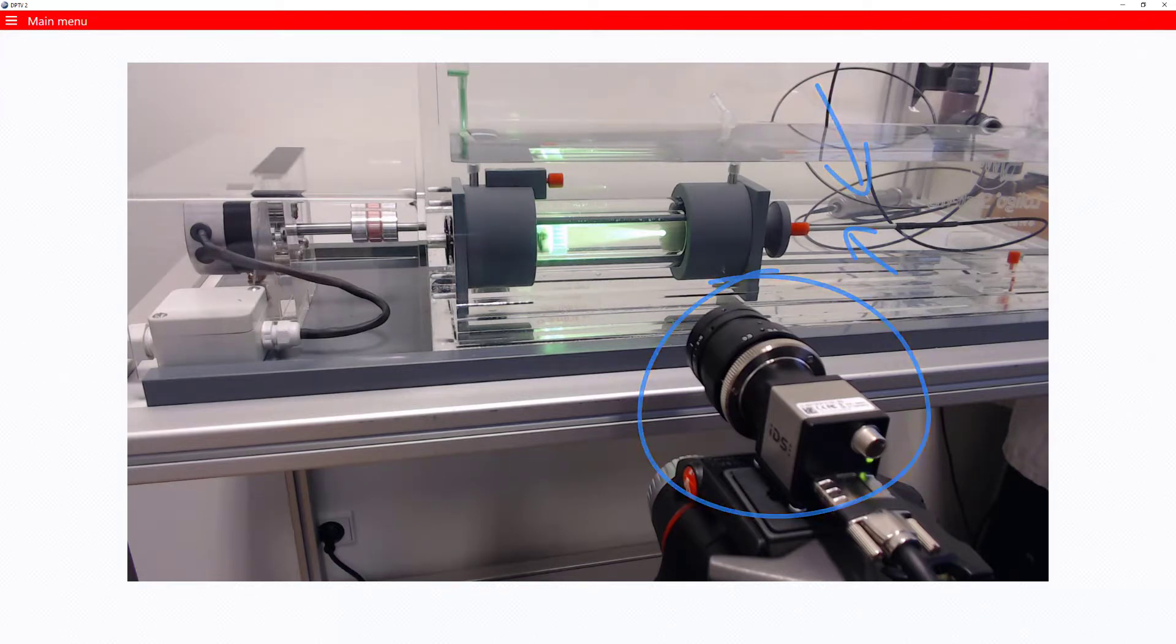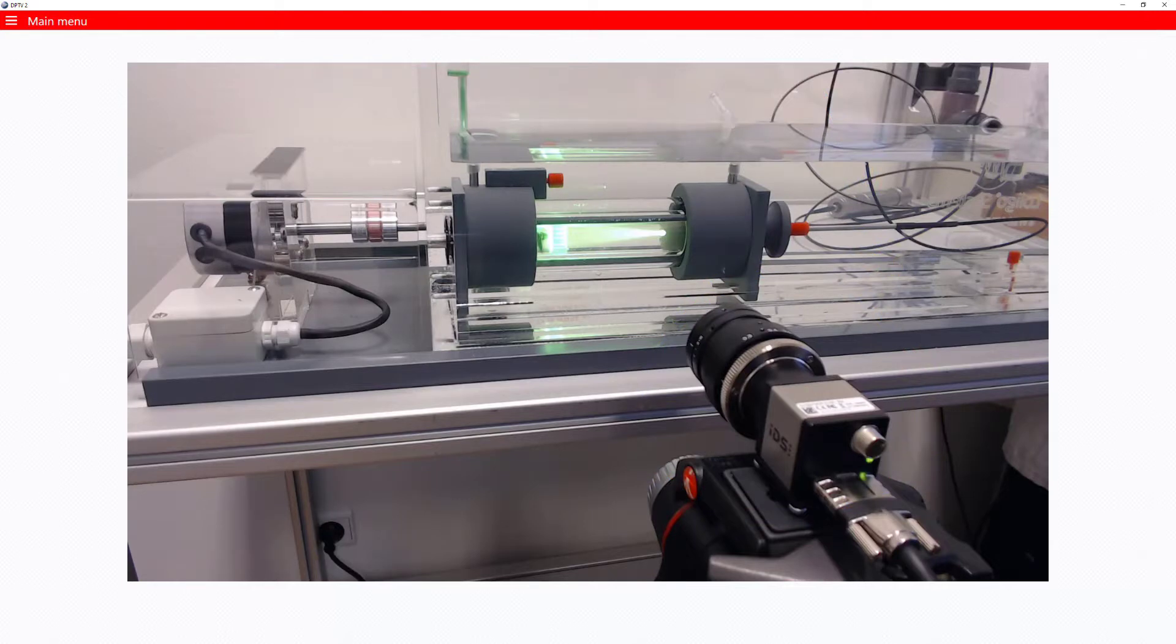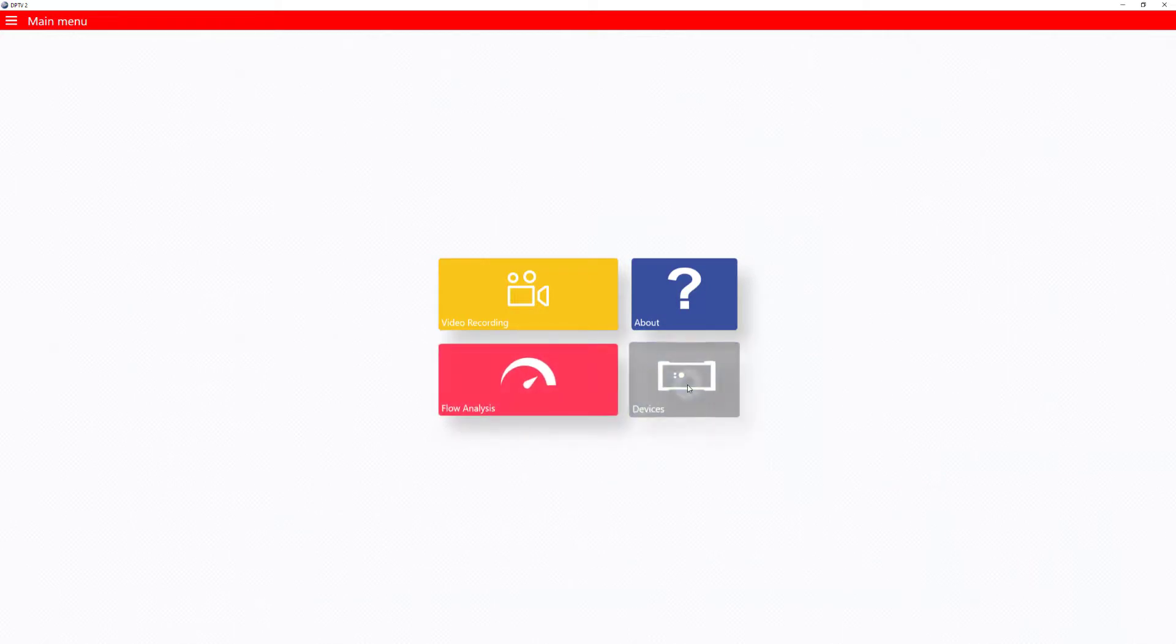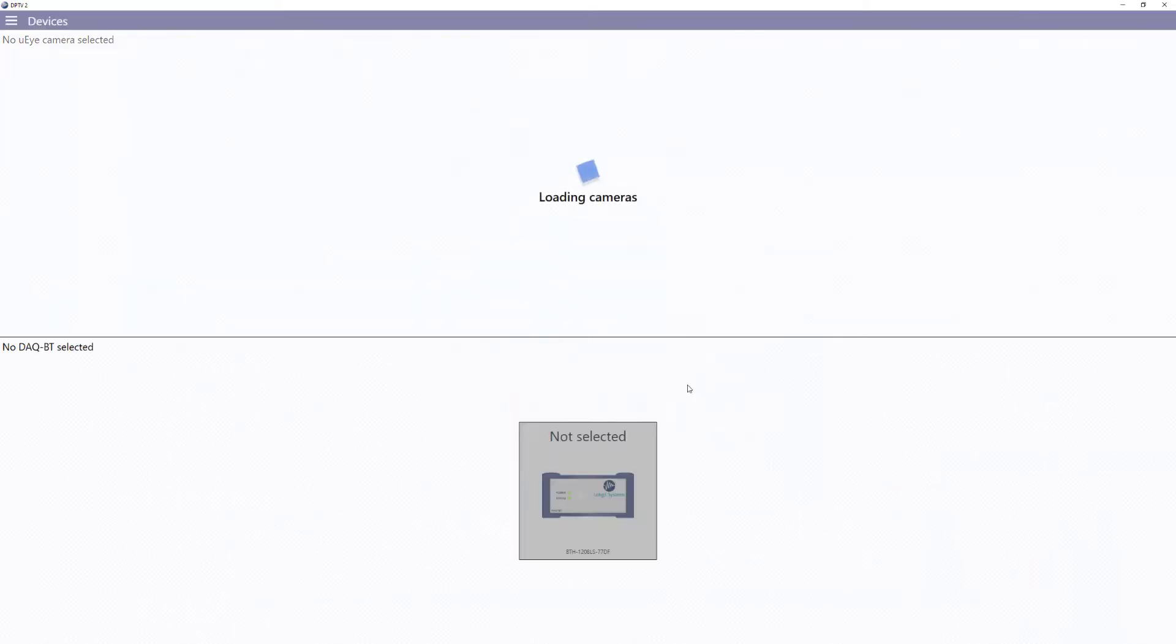In other words, the swim tunnel is ready to use for the automated water velocity calibration in DPTV2. First, you connect your DACBT device and camera.